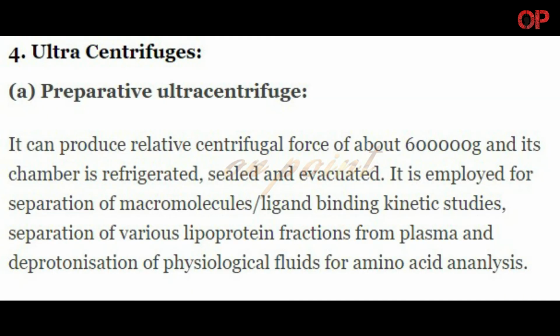Ultracentrifuges. A. Preparative ultracentrifuge. It can produce relative centrifugal force of about 600,000 G, and its chamber is refrigerated, sealed, and evacuated. It is employed for separation of macromolecules or ligand-binding kinetic studies, separation of various lipoprotein fractions from plasma, and deproteinization of physiological fluids for amino acid analysis.